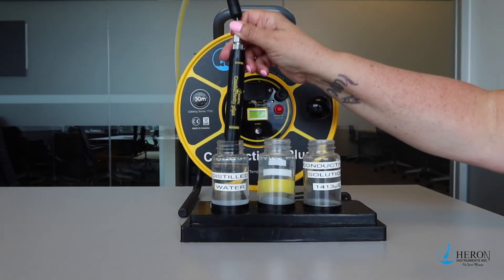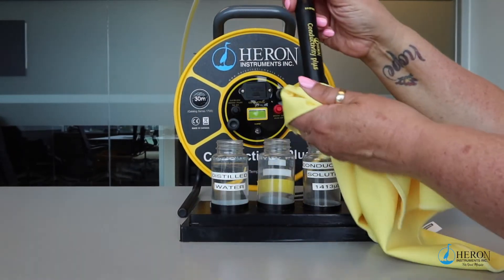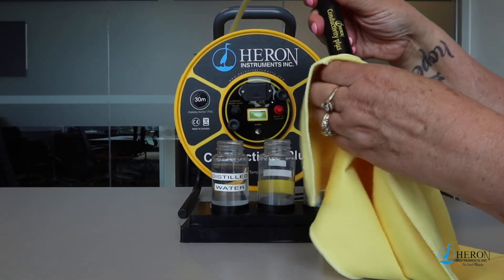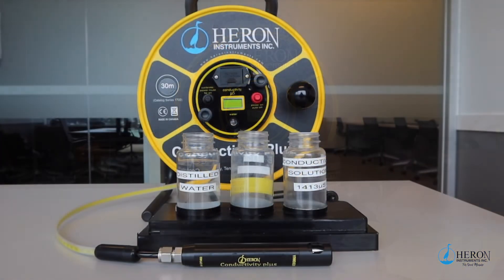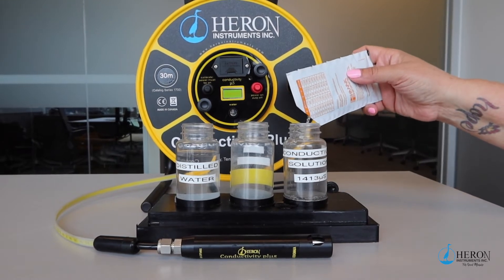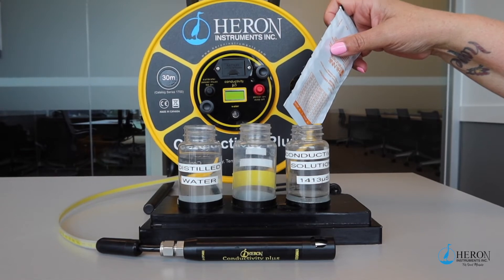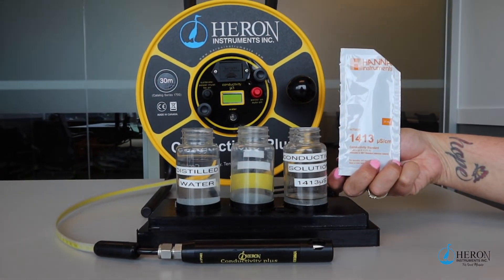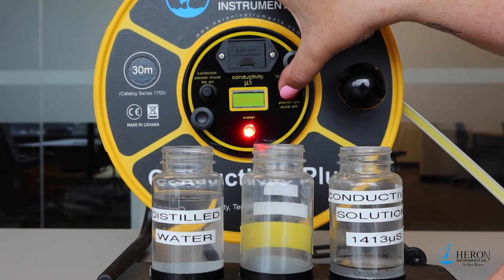Thoroughly decontaminate and clean the probe tip with distilled water and make sure it is completely dry. Pour the pre-mixed 1413 calibration solution in a small container. The calibration solution for conductivity is available from Heron or most any instrumentation rental shop or distributors worldwide. This is a standard solution. Press the power button to turn the meter on.